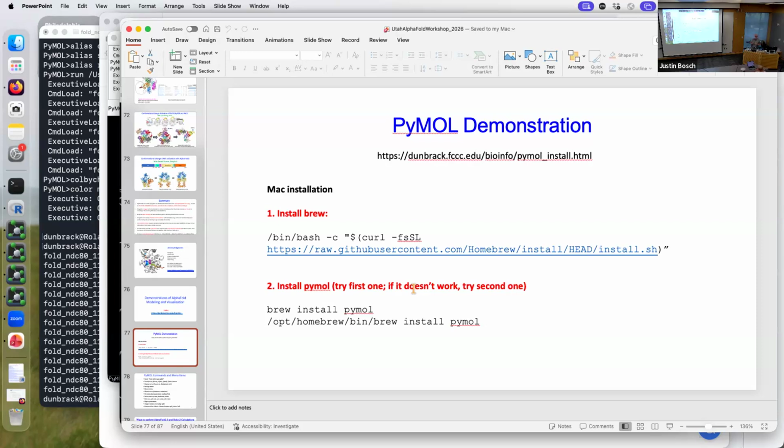I don't like the pictures of proteins it makes. It makes them look like ribbon candy. They look like you just want to eat them and get a cavity or something, and become diabetic maybe. But you can change those settings so that you can make it better looking. I like the images that PyMOL produces. PyMOL is also smaller and simpler, so it's kind of easier to get a hold of than Chimera. So I typically use PyMOL. People in my lab, some of them use Chimera, and we have fights about it, like which one's better.